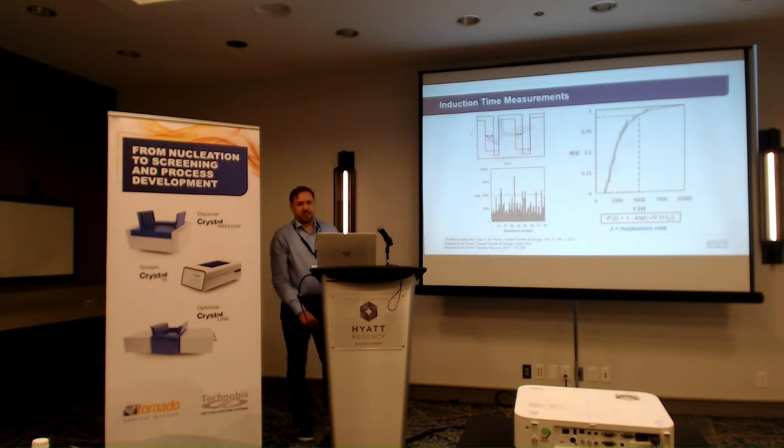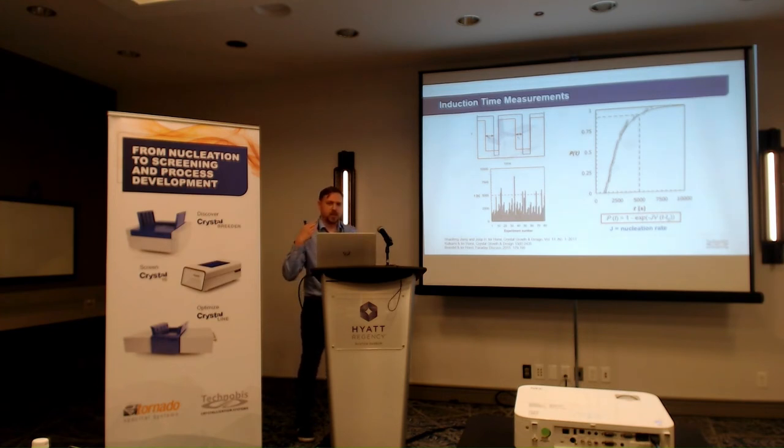So what ultimately does that mean? What we can do is temperature cycle between dissolving our suspension and then cooling that back down to a given supersaturation to then induce crystallization. We can measure the time between when the supersaturation is first reached and when the crystals are first detected. And that gives us our induction time here.